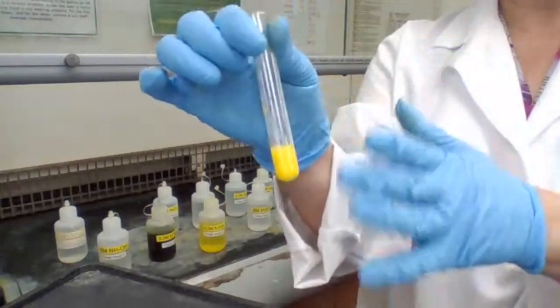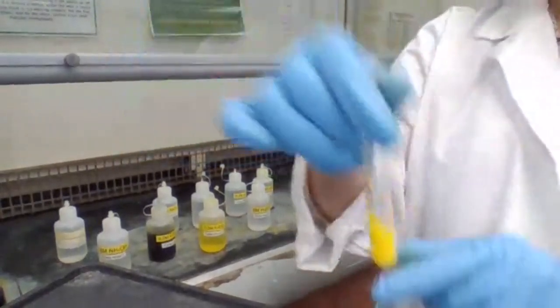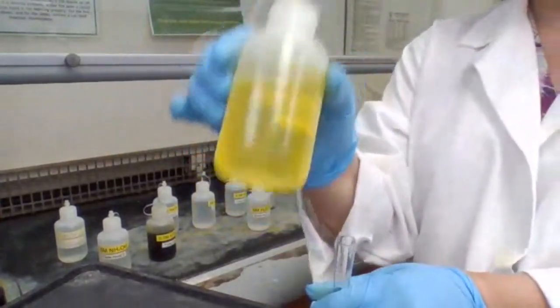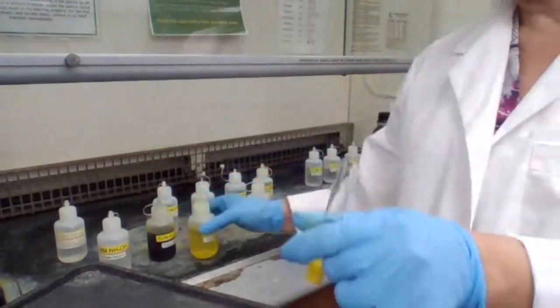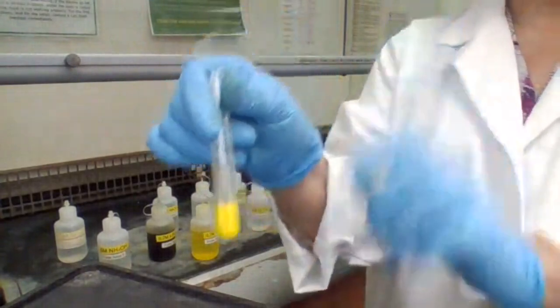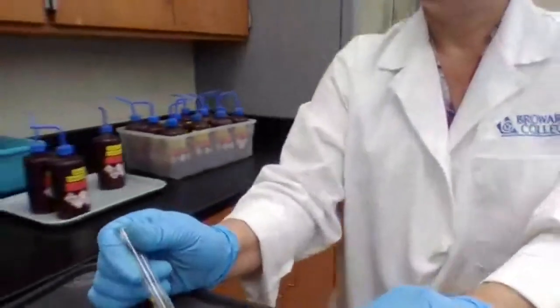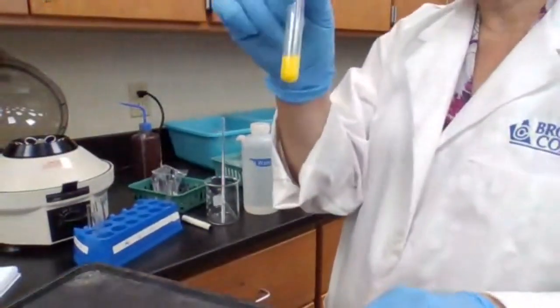And if you don't see that color precipitate, see, it's cloudy, if you see just the yellow color liquid, that's not the confirmation. That's not the positive test for lead. But if you see yellow color solid precipitate, that confirms you have lead in the mixture. So after the 4 ions, we confirmed already 1, and that is lead.